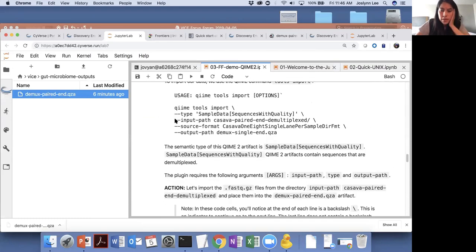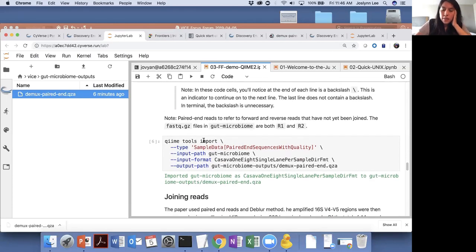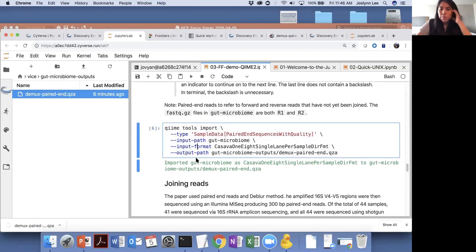So I don't know if the user had an issue with the import, or if it's the next step of denoising or the clustering step. If the person who wrote the question, Christopher Cullis, could clarify that. I think you had said in your demonstration here that you needed to have the metadata file already in there. Does that?